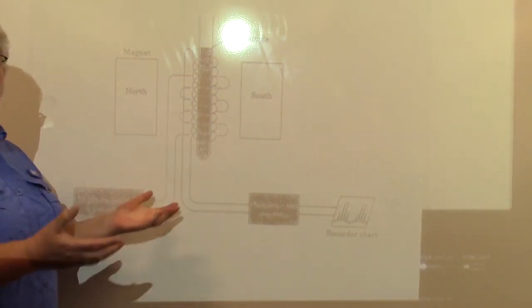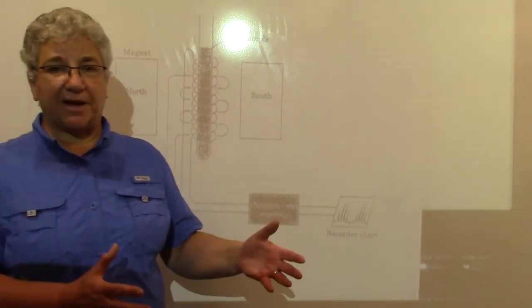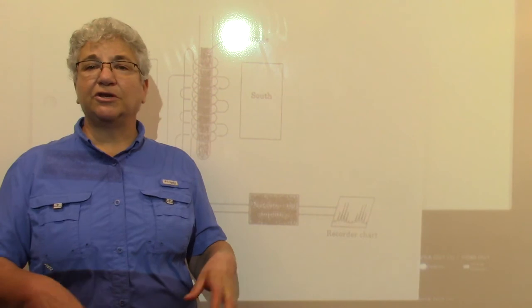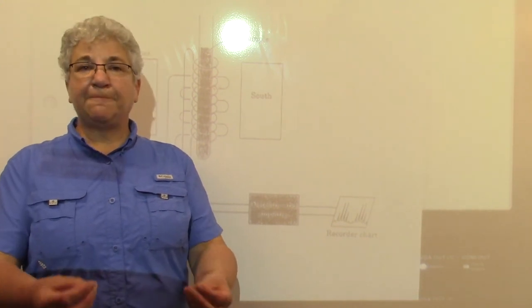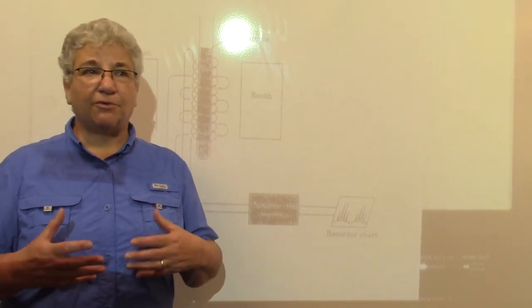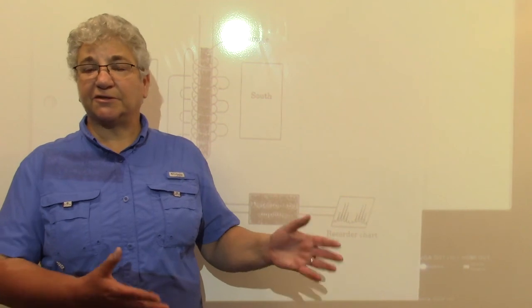You will see when you come to use ours that really the important part of the NMR itself, and so actually let me just back up for a second. NMR spectroscopy stands for nuclear magnetic resonance. Some of you may be familiar with MRI, which is magnetic resonance imaging. And so the technology or the process or the whole thought of how MRIs work, which you might be familiar with, really came from NMR spectroscopy in the realm of the chemists and the physicists, right?